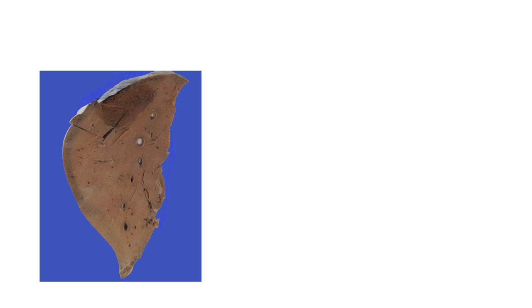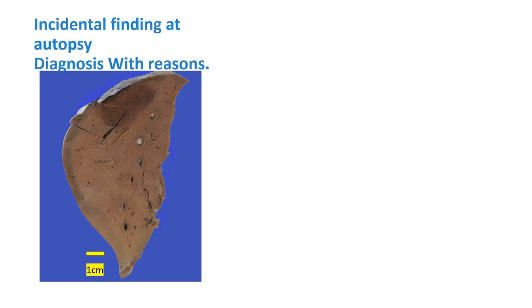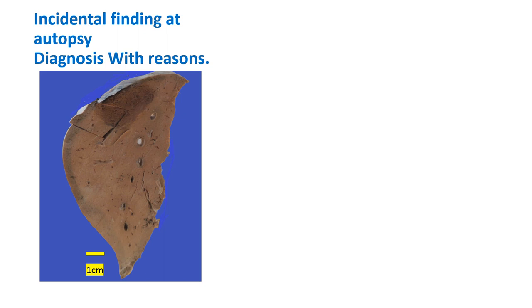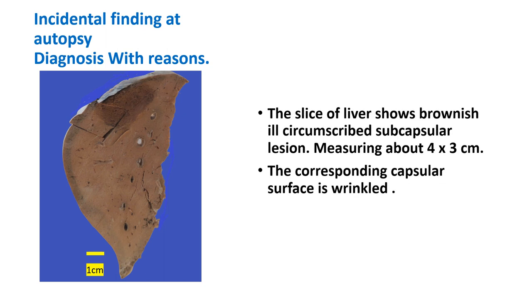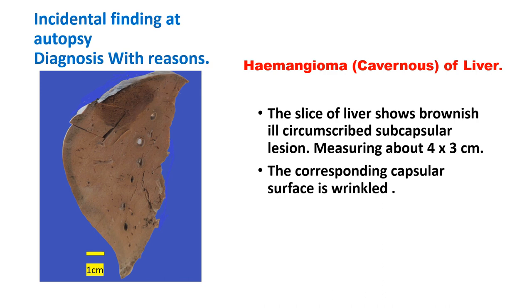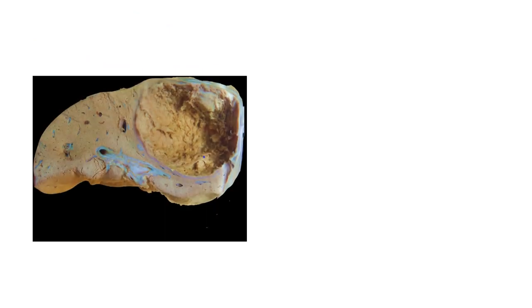One more interesting specimen you may encounter in some lab museums. This is an incidental finding at autopsy — the slice of liver shows a brownish ill-circumscribed subcapsular lesion about four by three centimeters. The corresponding capsule also shows dark coloration and is wrinkled. This is a classic case of hemangioma, and these incidental hemangiomas in the liver are often of the cavernous type.